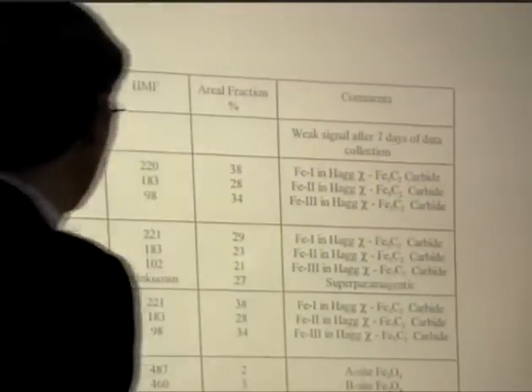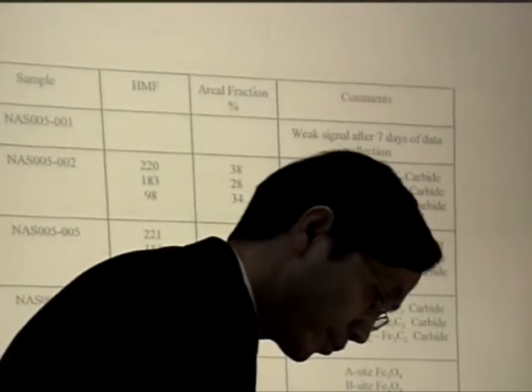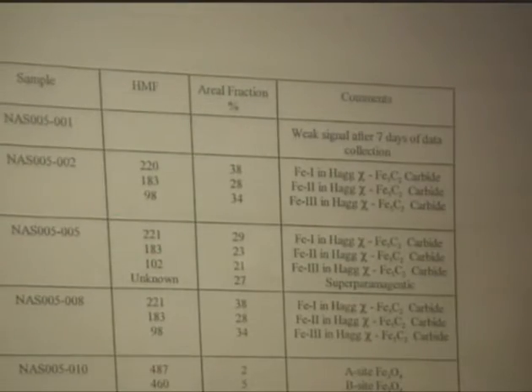That's the actual data from the Mössbauer analysis results. Now that's the 21 hours. We get almost 100% carbides, all kinds of carbides. That's 51 hours reaction.